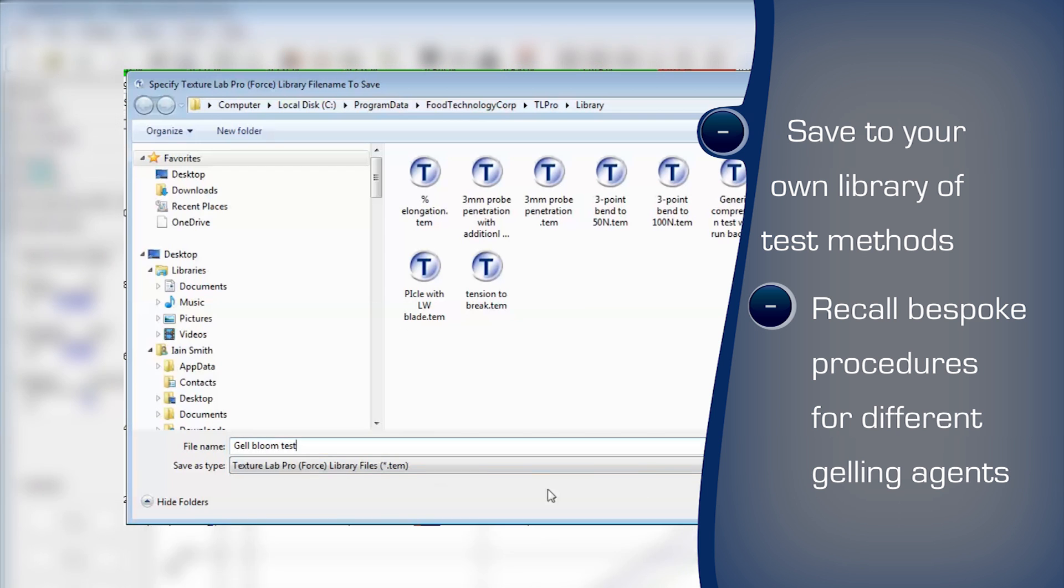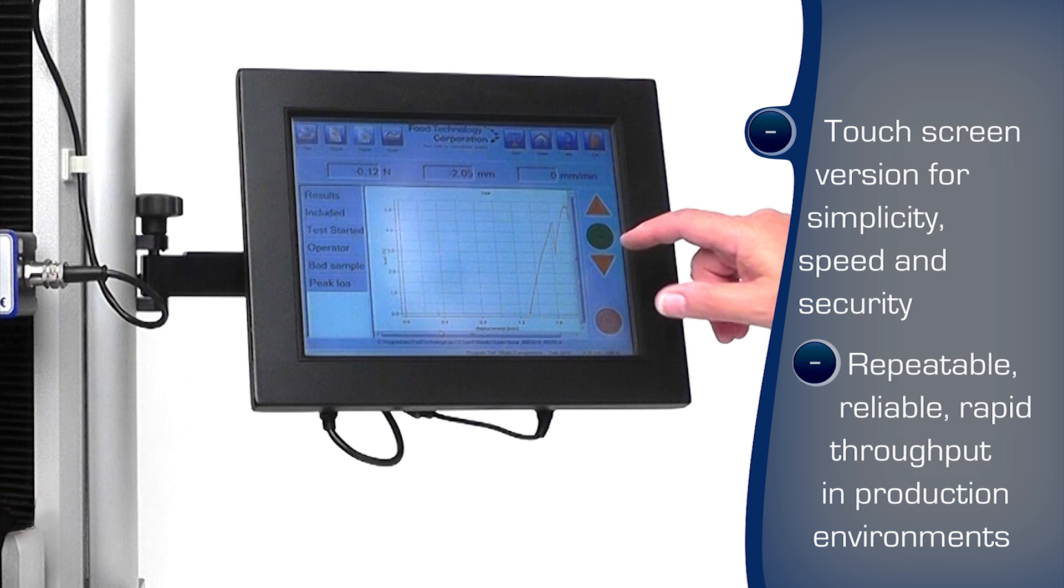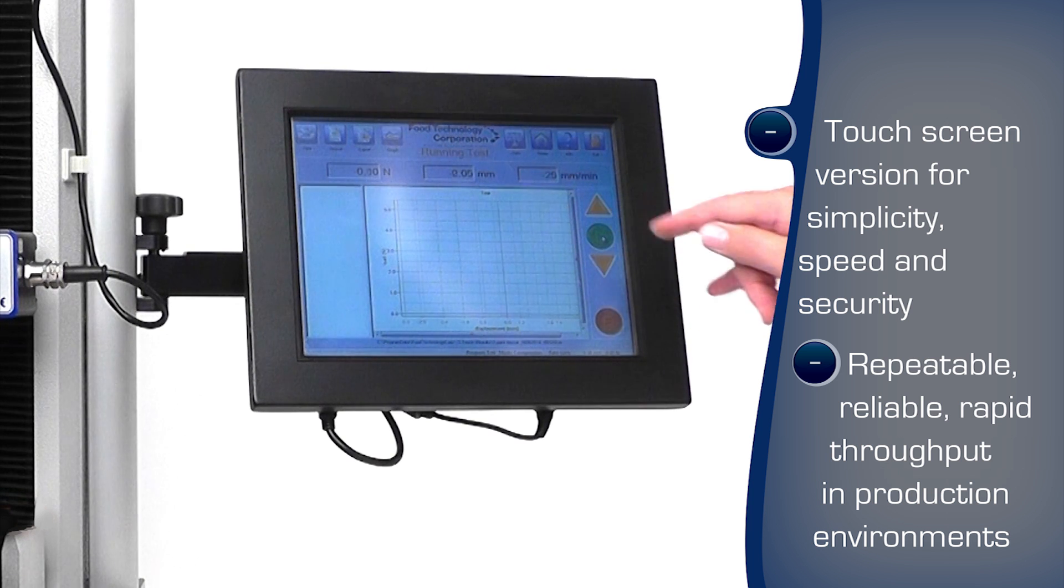The program can be saved to a library and recalled for reuse. The touchscreen-controlled texture analyzer runs tests at the push of a button with minimal training, ideal for quick, reliable, and repeated testing to quality standards.